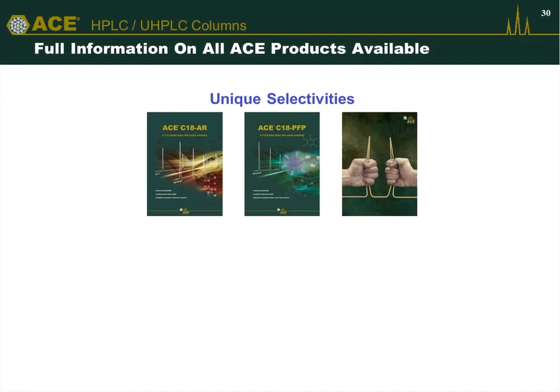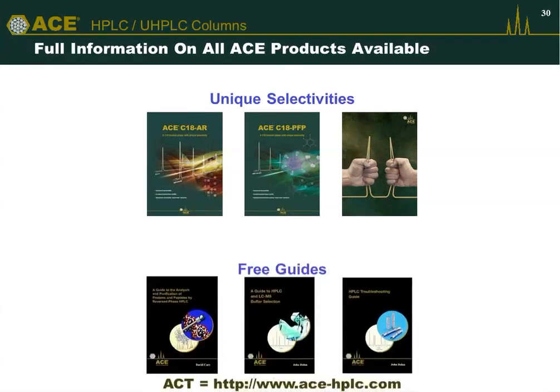Now, the phases I've talked about today, there's a lot more data on these phases, the C18AR and the C18 PFP, and there are separate information and brochures available on these phases, things like stability, applications, which I haven't had time to talk about today. Those are available if anybody is interested.